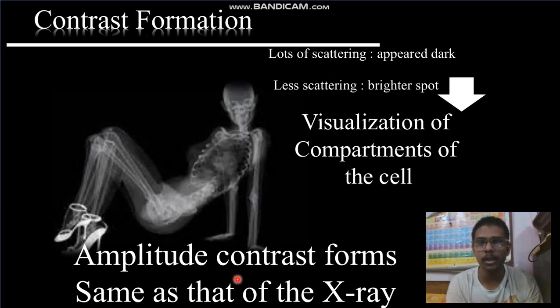Whenever you go to the doctor, they show you the black and white image of your bone, bone marrow, or any other structures. What is the mechanism there? The X-ray or some subatomic particles penetrate your body and make the image.